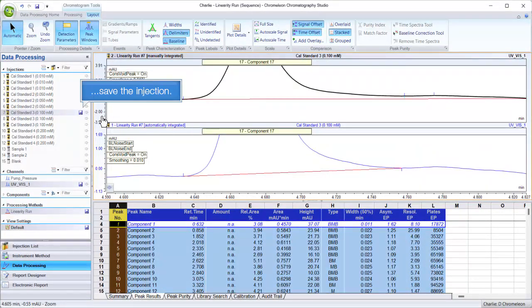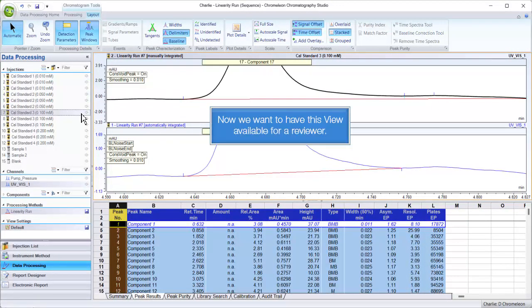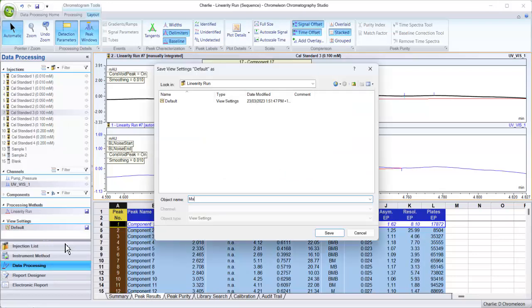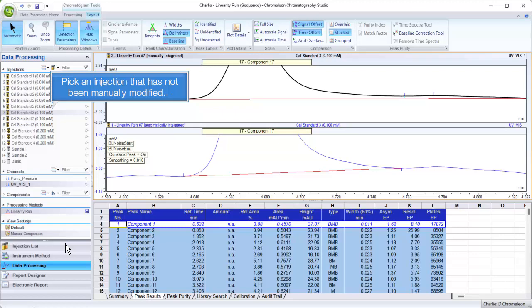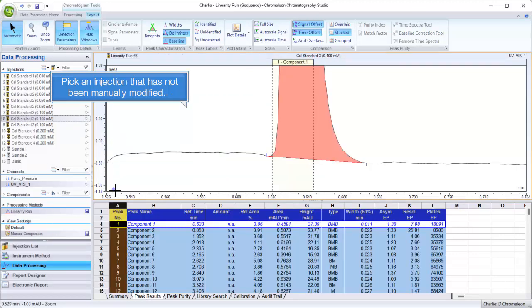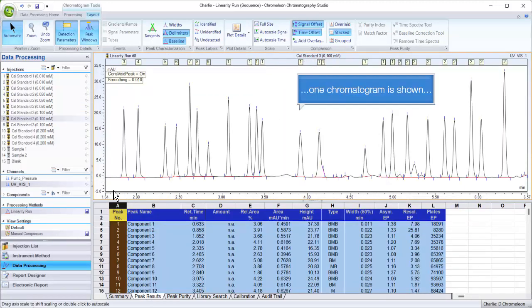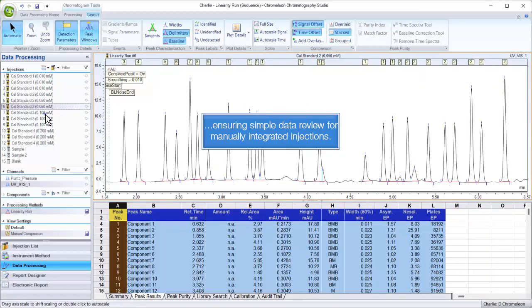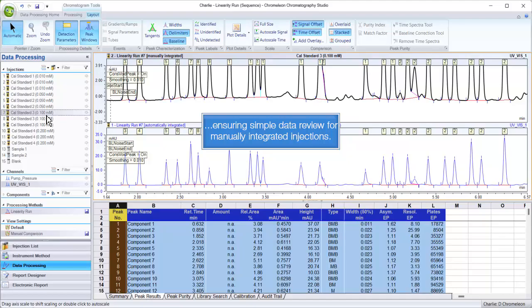Save the injection. Now we want to have this view available for a reviewer. Pick an injection that has not been manually modified — one chromatogram is shown — but two are automatically shown for modified ones, ensuring simple data review for manually integrated injections.